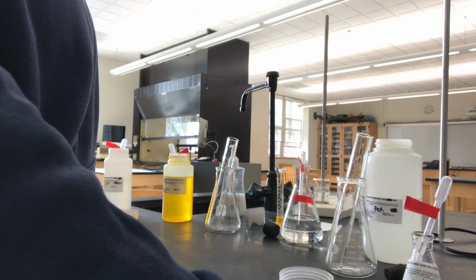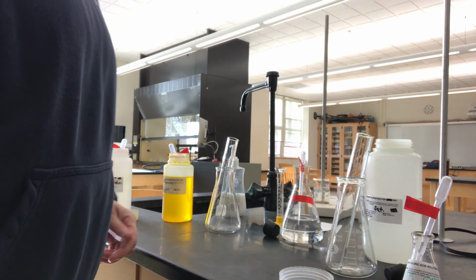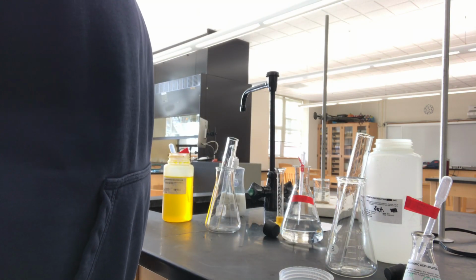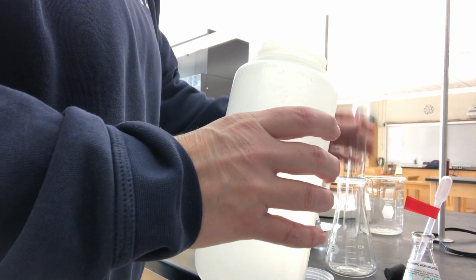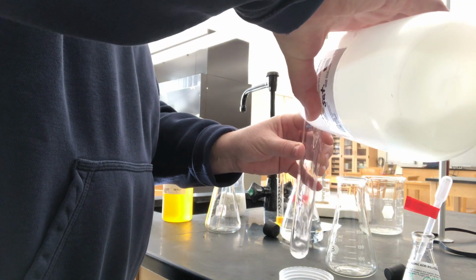Okay, we're going to look at part F, which is the saturated solution equilibria. So this has two parts. The first part has to do with the sodium chloride. So I'm going to start with saturated sodium chloride. Be sure to do the calculation they ask you to do in the lab. So I'm just going to put some here in my test tube.